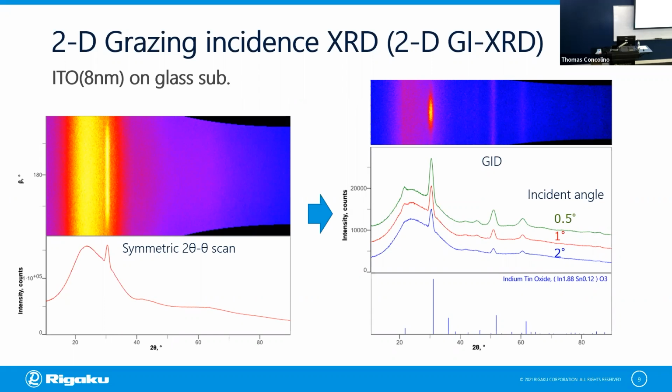So in the standard configuration, it's impossible to achieve GI-XRD with the 2D detector because the footprint is going to be very large. That means every diffracted peak is going to be broad, right? So you cannot separate the overlapped peaks. But as you see here, if you have a small beam, you can use the 2D detector even for GI-XRD. And I would say that it's reasonably sharp.